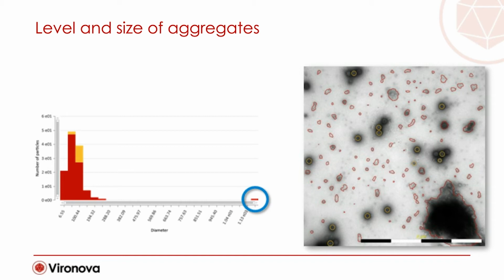Yeah, Martin, as you said, when working with viruses, you normally know the size of the virus that you're working with. So the virus peak in the histogram is not that interesting, actually. It just confirms that you have your product. It is actually the other information that does not belong to your virus peak that could be of interest.